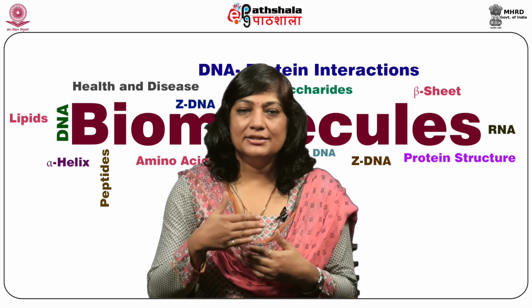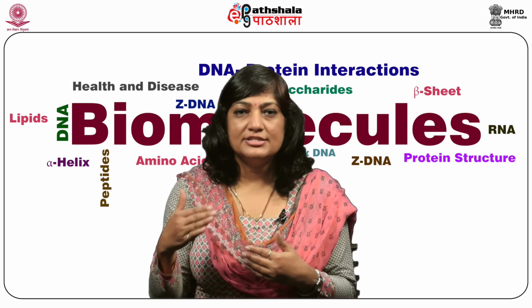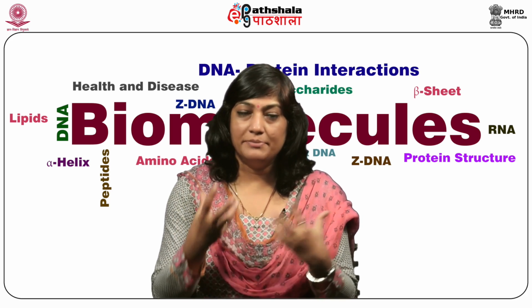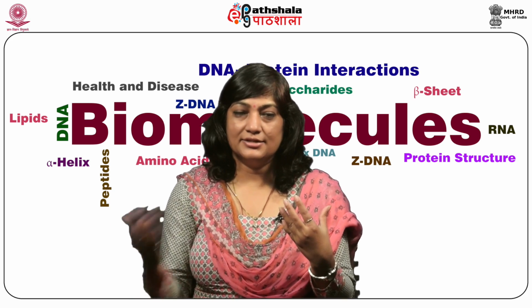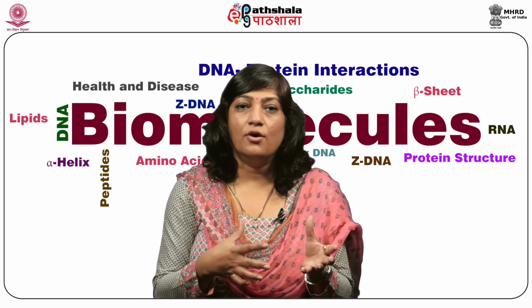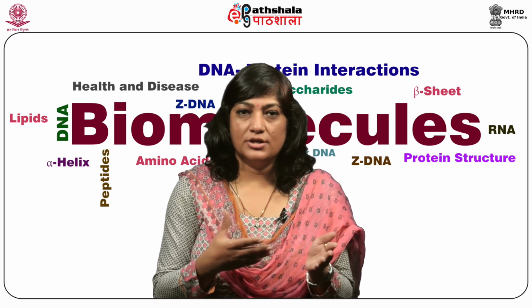And since they're most volatile, they will elute first from the column, while the less volatile compounds will get dissolved in the column material, which is the stationary phase, and hence will elute later. So the time that they spend in the stationary phase will be more, or in other words, they are retained in the stationary phase for a longer time.